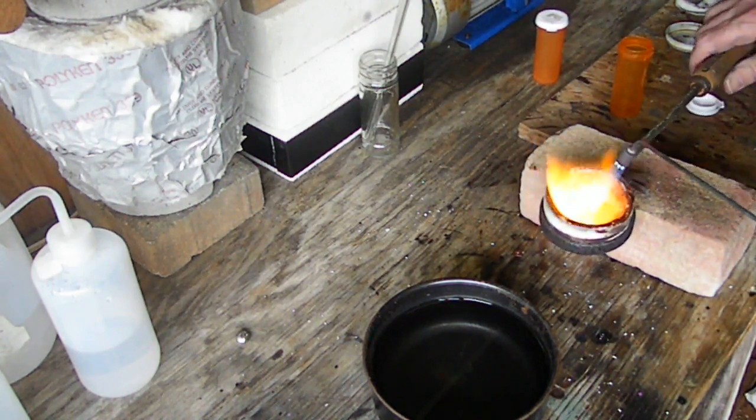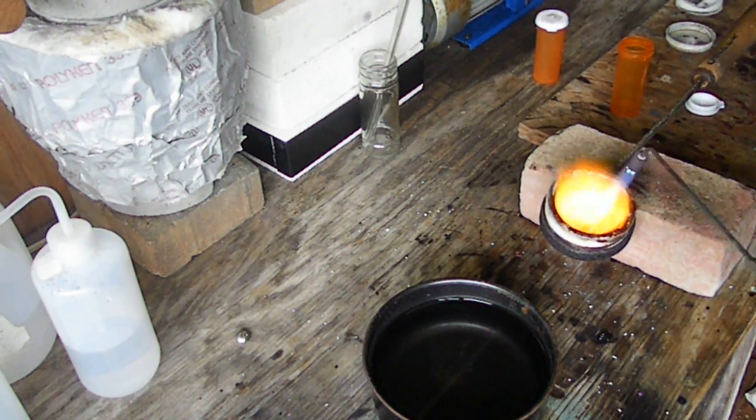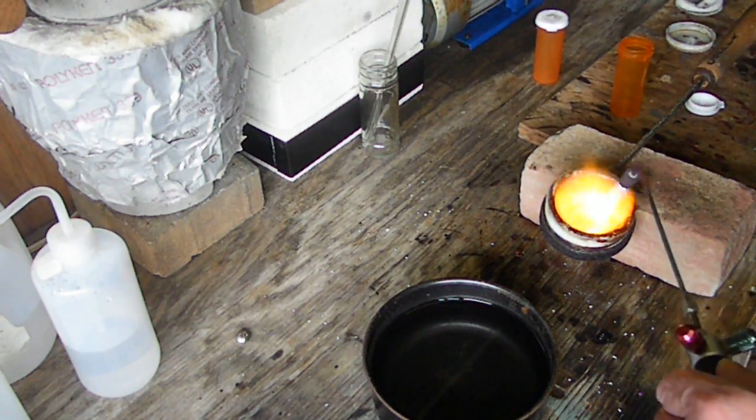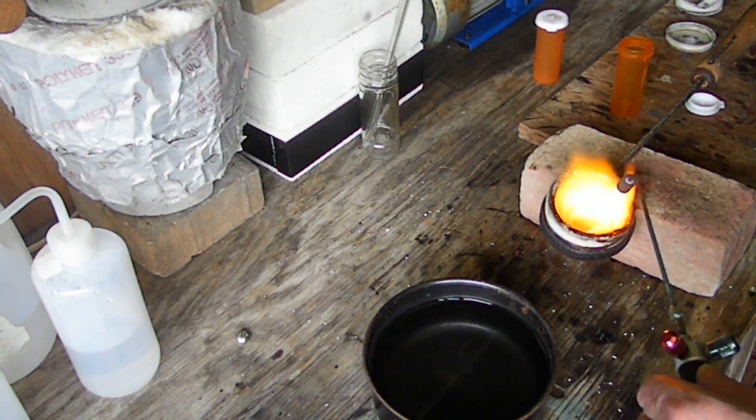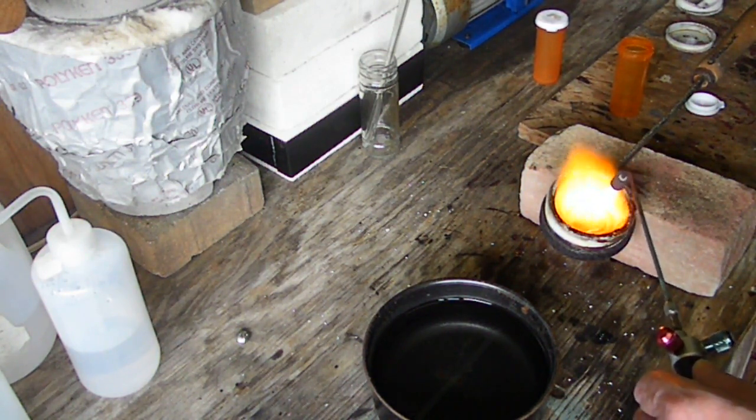We're almost completely fluid. I'm going to give it a little bit more because I want to get a good shot pour out of this, so I want to make sure that everything is incorporated and mixed up good.